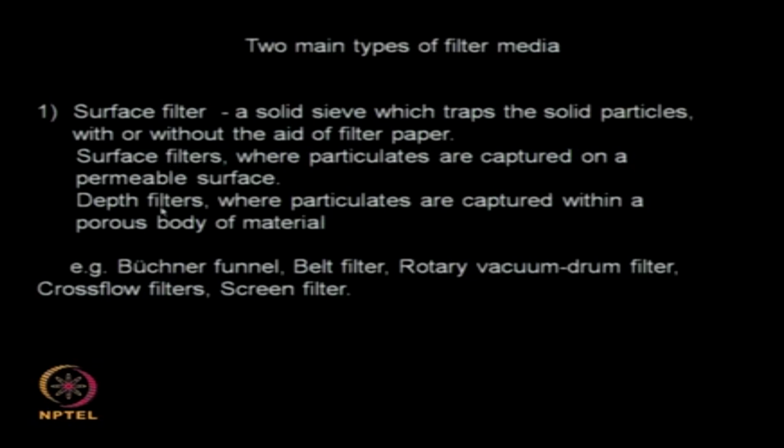Then you have depth filters where the particulates are captured within a porous body. So the depth filter will have several layers of material which captures the solid which you need to filter. So surface filters can be Buchner funnel, which we use in our lab, belt filters, rotary vacuum drum filter, we looked at it in detail some time back, then crossflow filters, screen filters and so on actually.